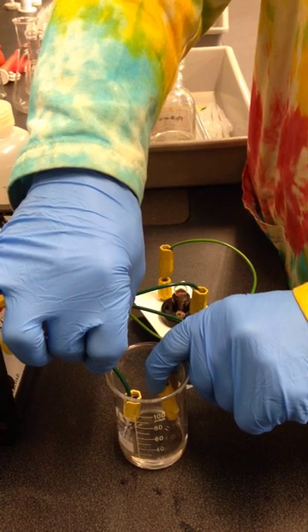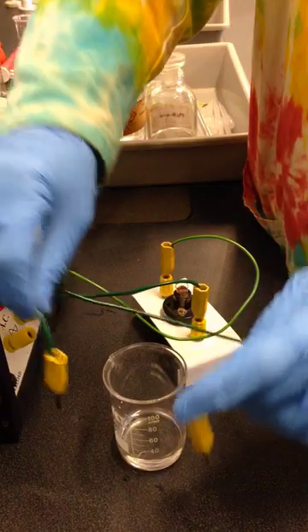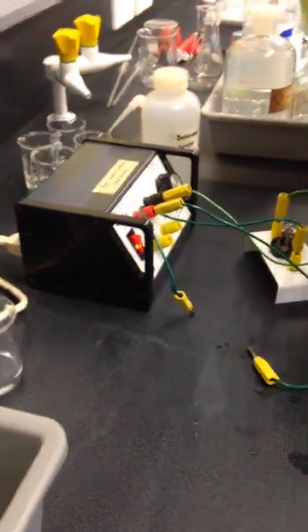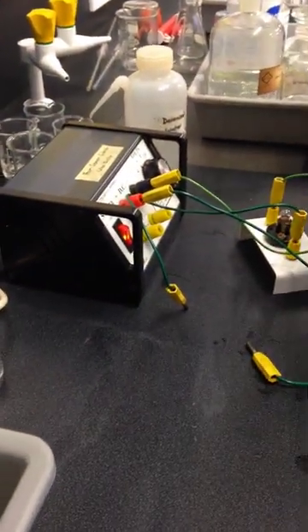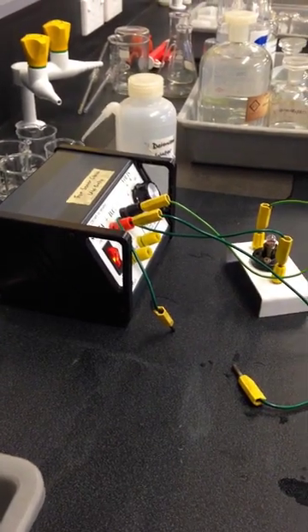Now just to make sure, to prove to you that there are no tricks going on here, I'm going to get a metal spatula or some form of metal somewhere. Just give me a minute, I'll go and get a spatula and come back.